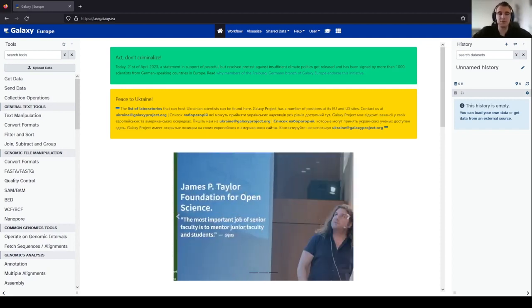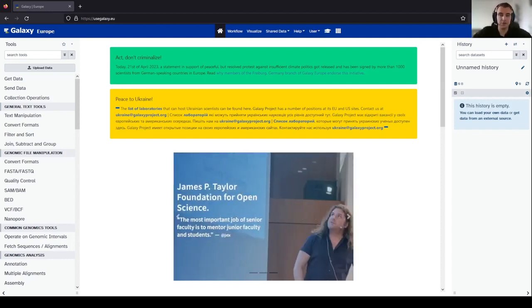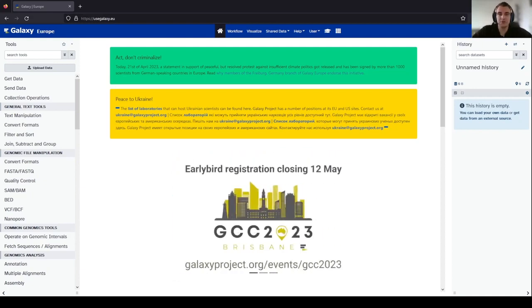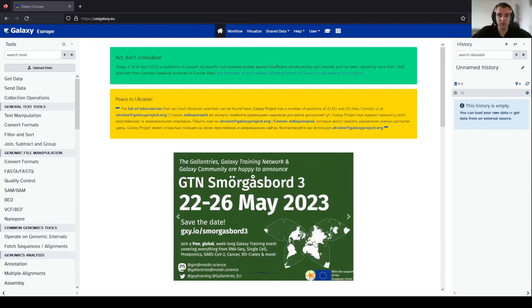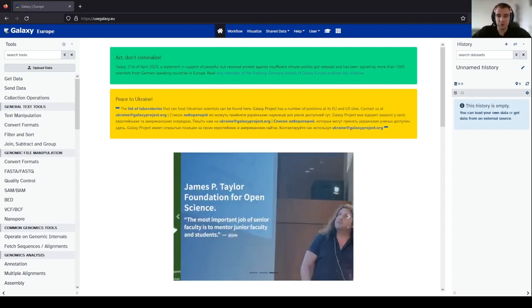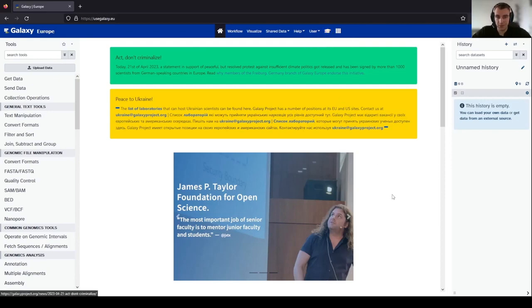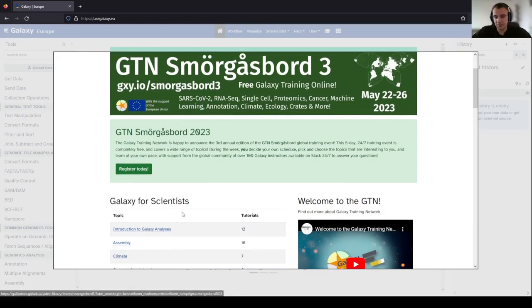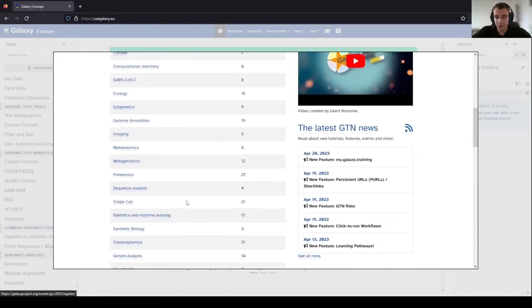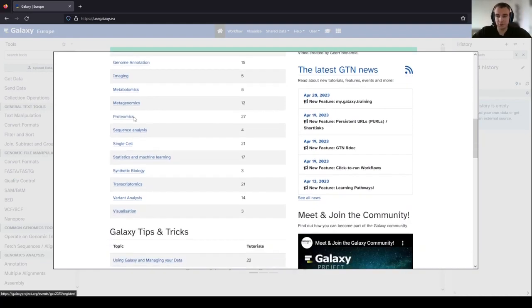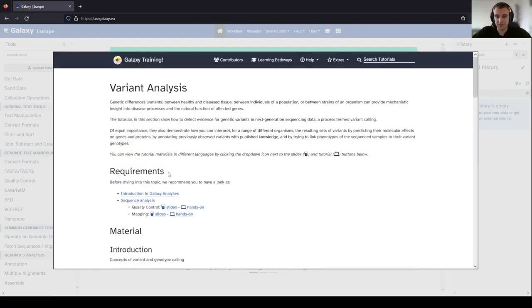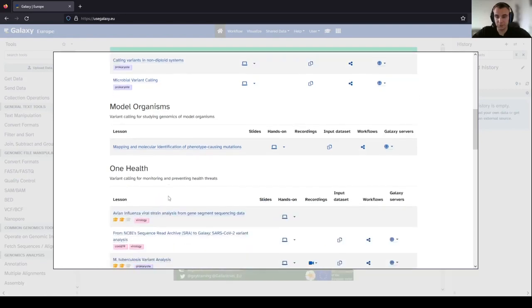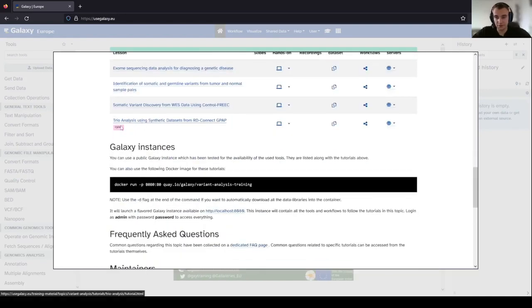Hello everyone, my name is Jasper Auerkerk and in this video I will be guiding you through the Galaxy tutorial Trio Analysis using Synthetic Datasets from RD-Connect GPAP. To open a tutorial you can click on this icon, which will show all the tutorials available in Galaxy. In this video we will go to Variant Analysis and scroll below to find our tutorial, Trio Analysis using Synthetic Datasets.